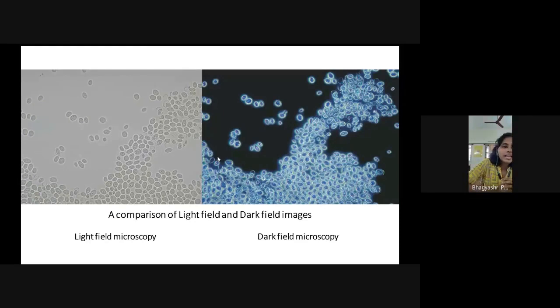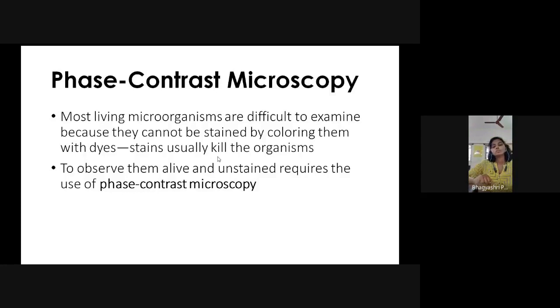Can anyone tell me why nigrosin black will not stain the bacterial cells? Can anyone explain the reason? If anyone knows the reason, just unmute yourself and answer.